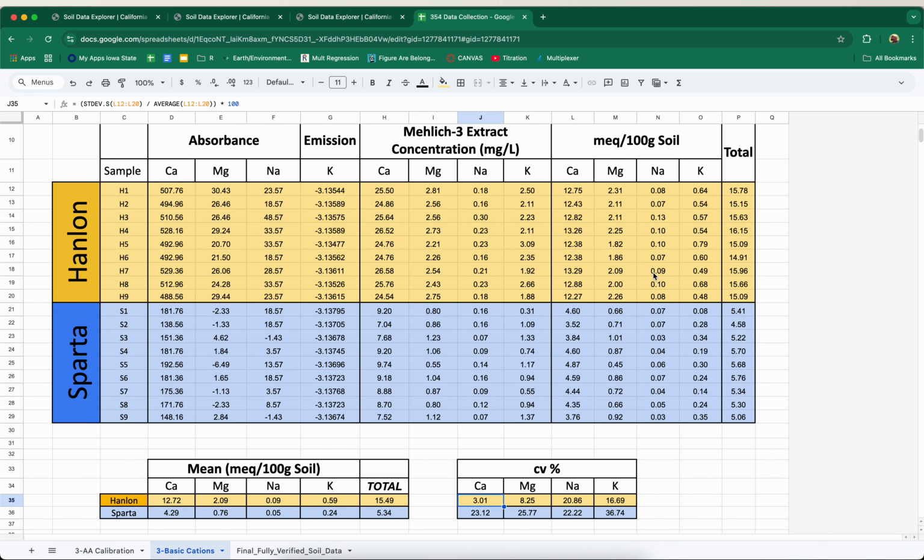So at this point, this is half of the picture, right? This is the base portion. We have the titrations that we did after the barium chloride extract. For both classes, we tried a normal diluted sodium hydroxide that we titrated against, as well as a hyper diluted one, at 0.002 normal, and the equipment and scales and burettes that we have is pretty questionable to begin with.